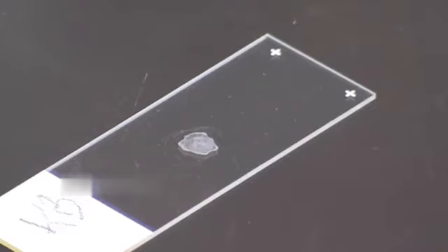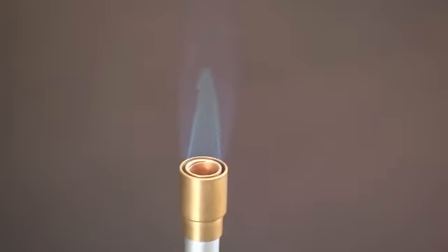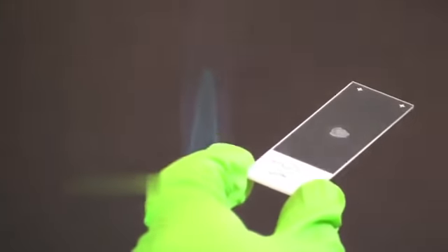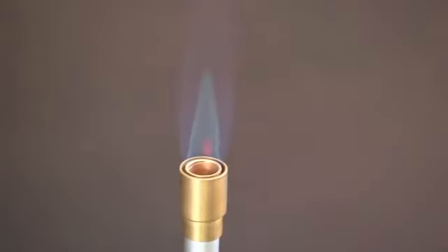Let the liquid completely evaporate, leaving behind a dry spot on the slide. This will take at least 10 minutes. Once the liquid has dried completely, heat fix the bacteria to the slide by quickly passing the slide through the flame 3 times. The flame should touch the slide for about 1 second during each pass.